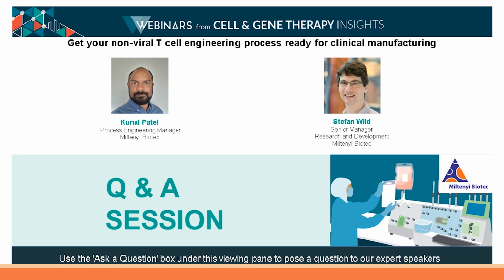Yeah, hi. Sorry, apologies for the technical difficulties earlier. But yeah, I would say Electroporation, and Stefan touched on a couple of these, is definitely a gene editing strategy that's really opening up the possibilities of what we can do now with our various gene editing strategies. The ability to add knock-in and knockout capabilities in conjunction greatly opens up the different types of therapies that we can produce, whether it's enabling the allogeneic space or even other complex modifications such as doing a knockout followed by an AAV transduction for targeted gene insertion. I think there's a lot of opportunities here that is really going to open up the field.